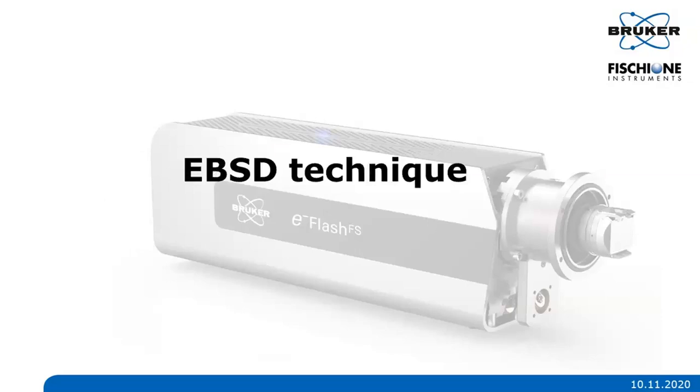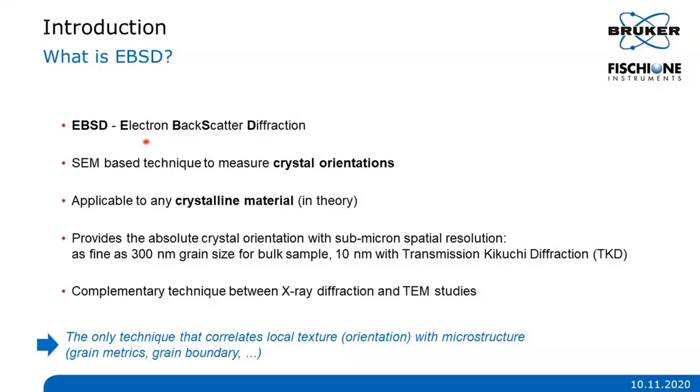So I will now introduce the EBSD technique for those of you who are not familiar with it. On the background is an image of our Bruker EBSD eFlash fast and sensitive detector. So what's EBSD? EBSD stands for electron backscatter diffraction. It's a scanning electron microscope-based technique that measures the absolute orientation of crystalline materials.